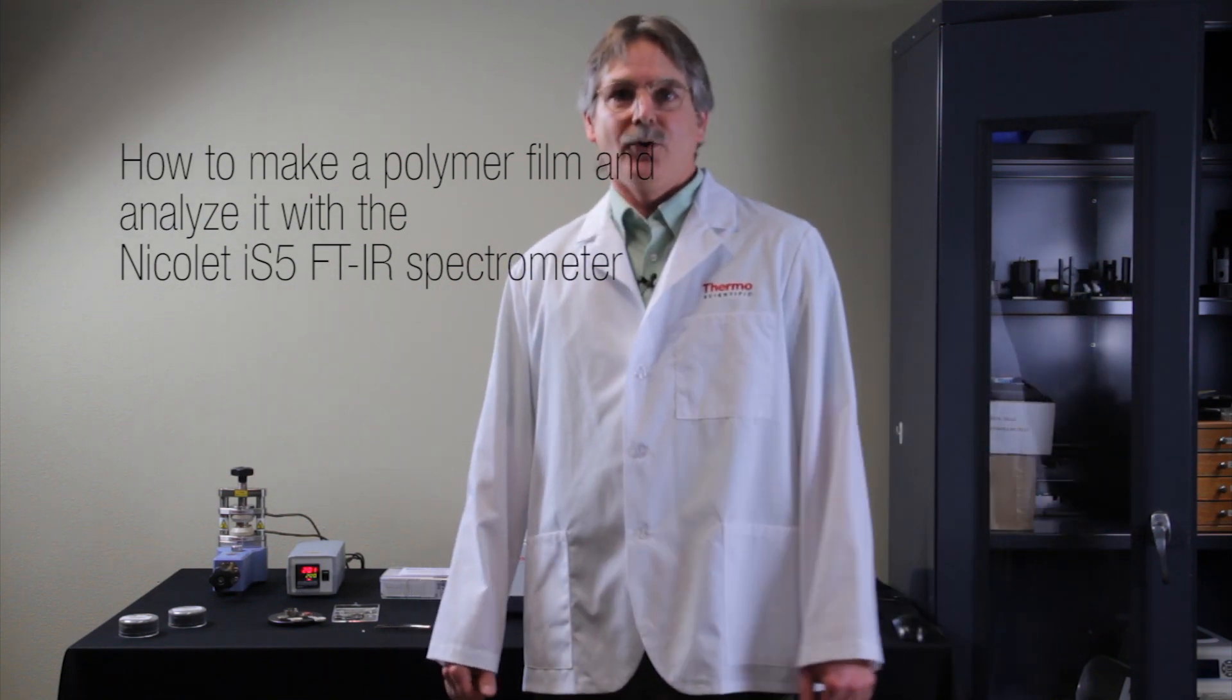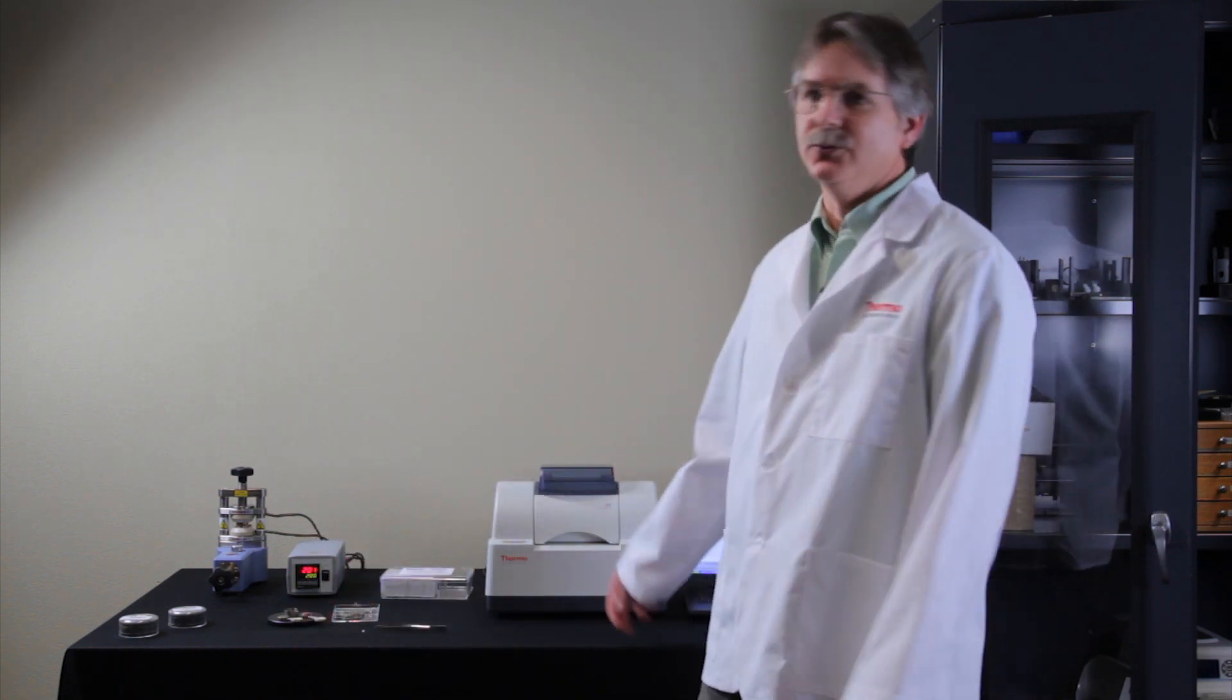Today our goal is to analyze films made by the SPECAC Filmmaker and then placed into the IS-5 Spectrometer. The people who would use these devices would be QA, QC people looking at polymer analysis as well as researchers who might be looking at additives to be used in polymers.